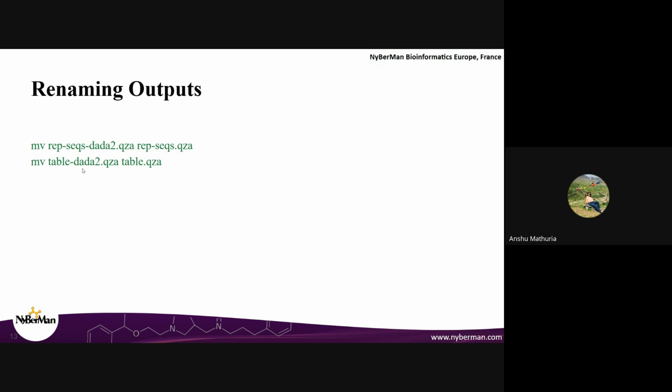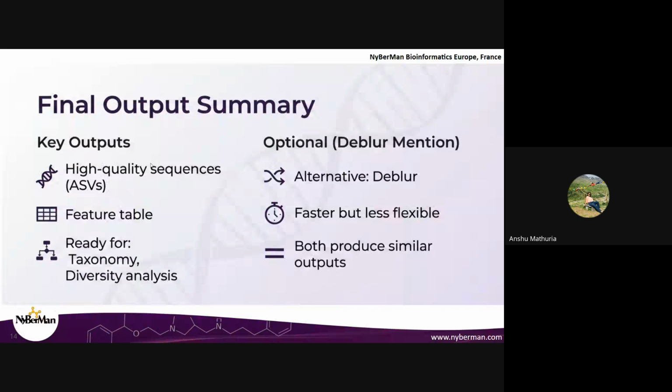These are the normal files. I have removed dada2 from the names because this is the nomenclature that is used further. So just to prevent any conflict or error in the commands, I have renamed them. After running all the commands, you also rename the generated files to rep-seqs.qza and table.qza so that we can move further. There shouldn't be any problem with the commands, because I will be putting these names in the further commands, not the dada2 names.